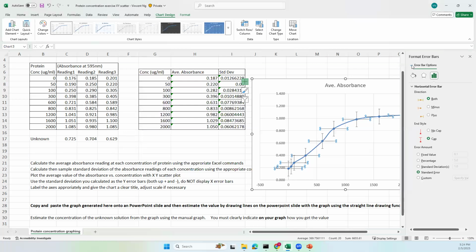If you have a PC, like what I use, it is very simple. On a Mac, you can find the corresponding commands in different areas, but I don't have a Mac, so I don't know how to demonstrate with one. You want to fix the horizontal error bar first. Series X is the horizontal error bar. Now make sure you are at this graphical icon.